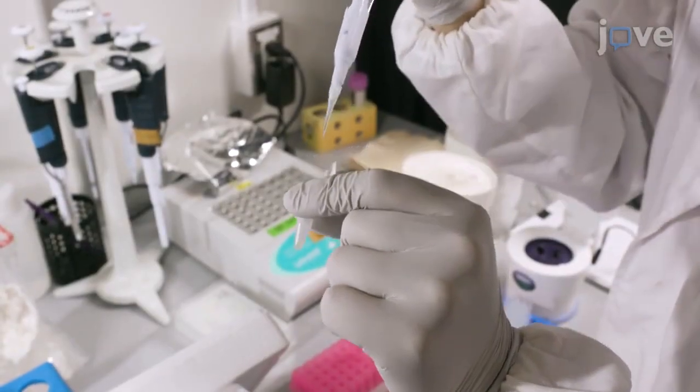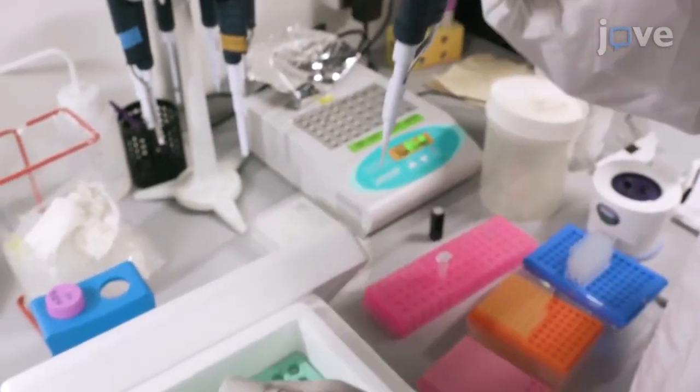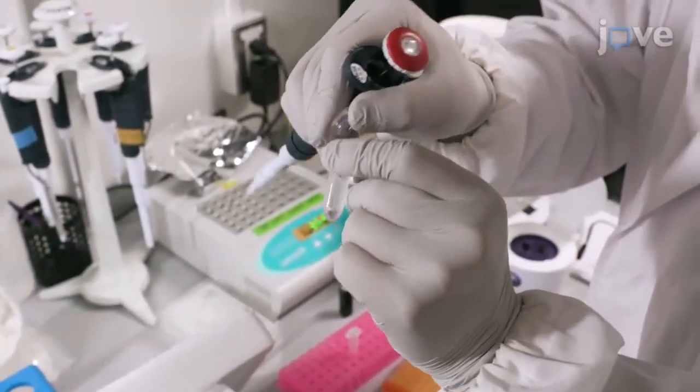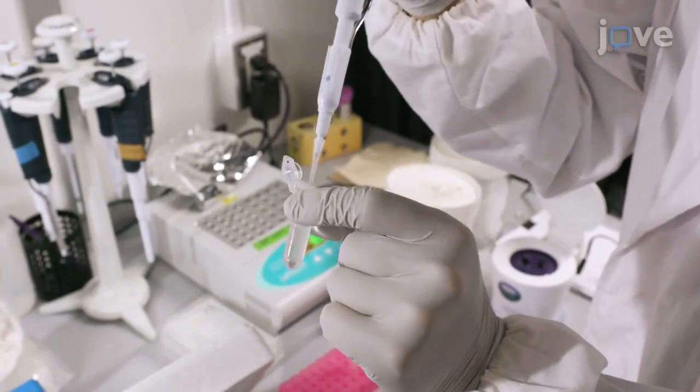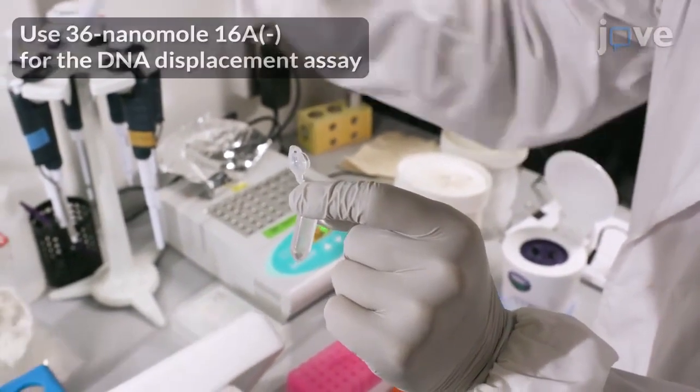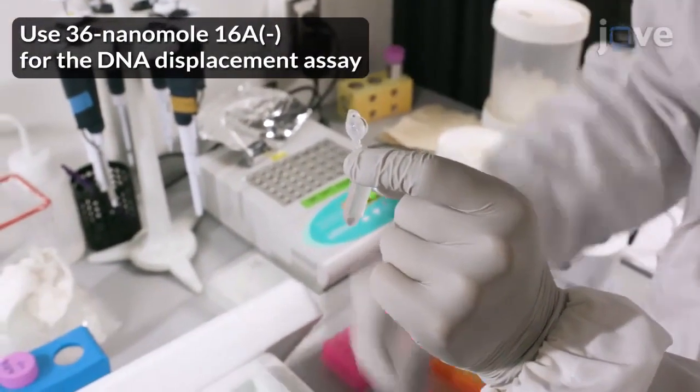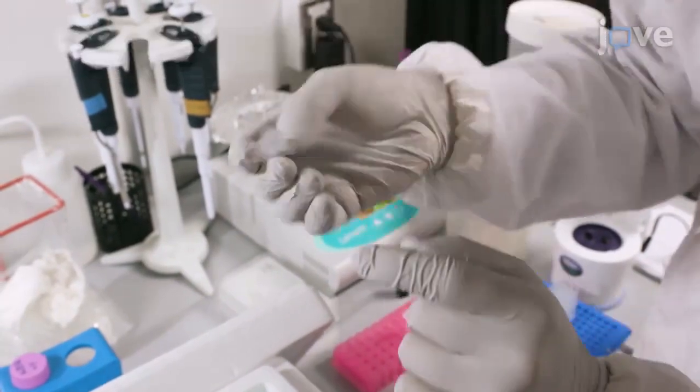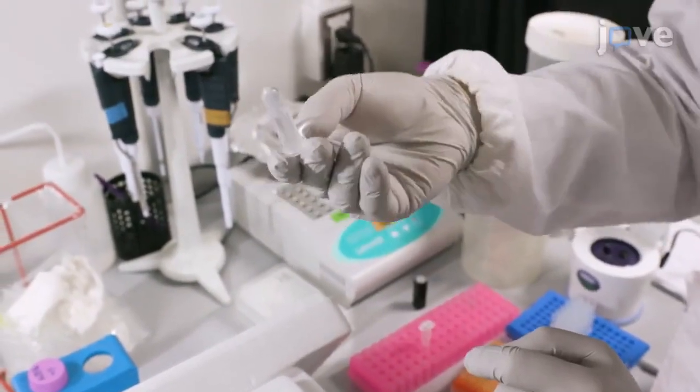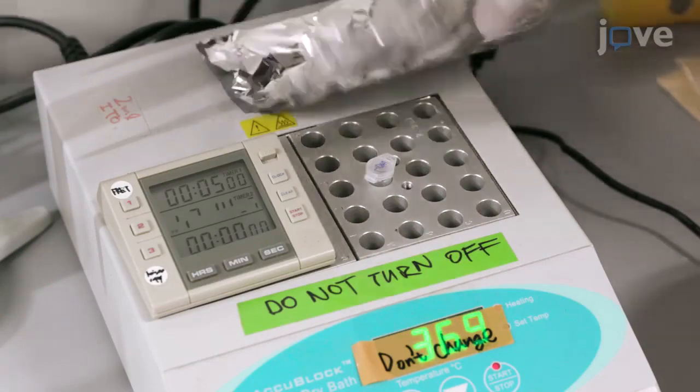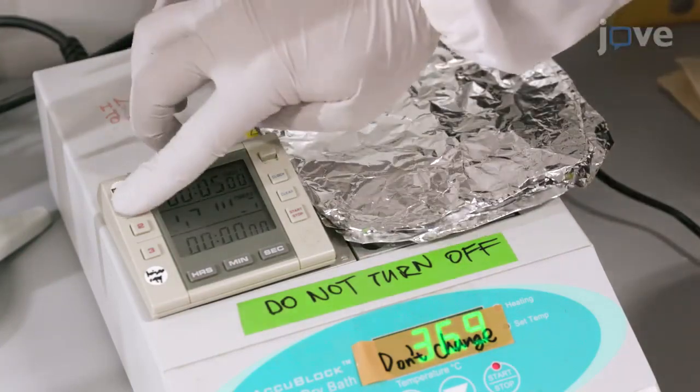To begin, prepare the reaction buffer A according to the text protocol. Next, add 36 nanomole 16FA-oligonucleotide to the buffer for the DNA pairing assay. Incubate the mixture at 37 degrees Celsius for 5 minutes.